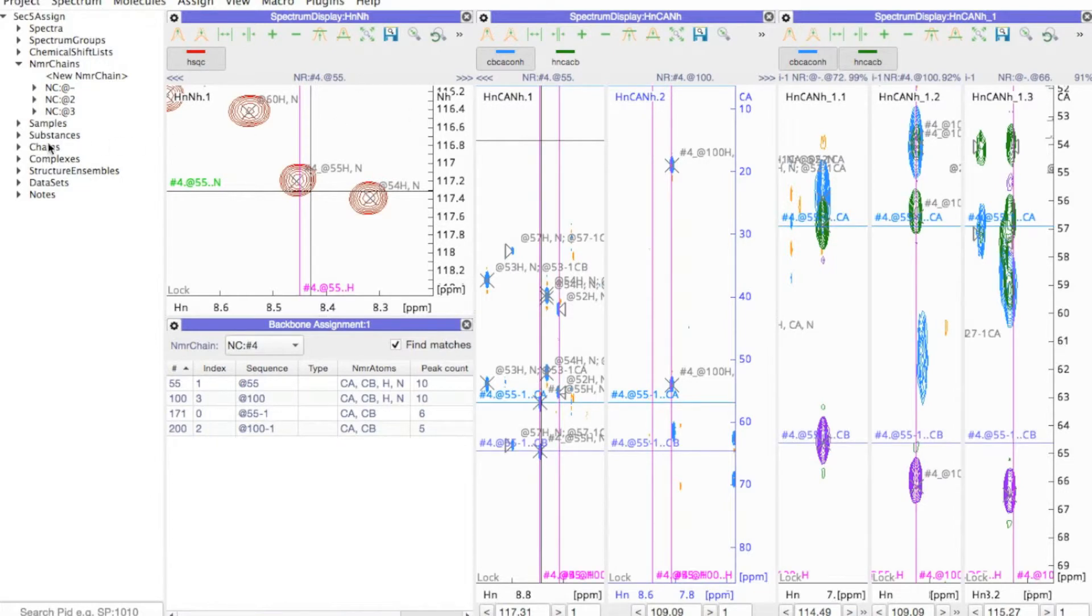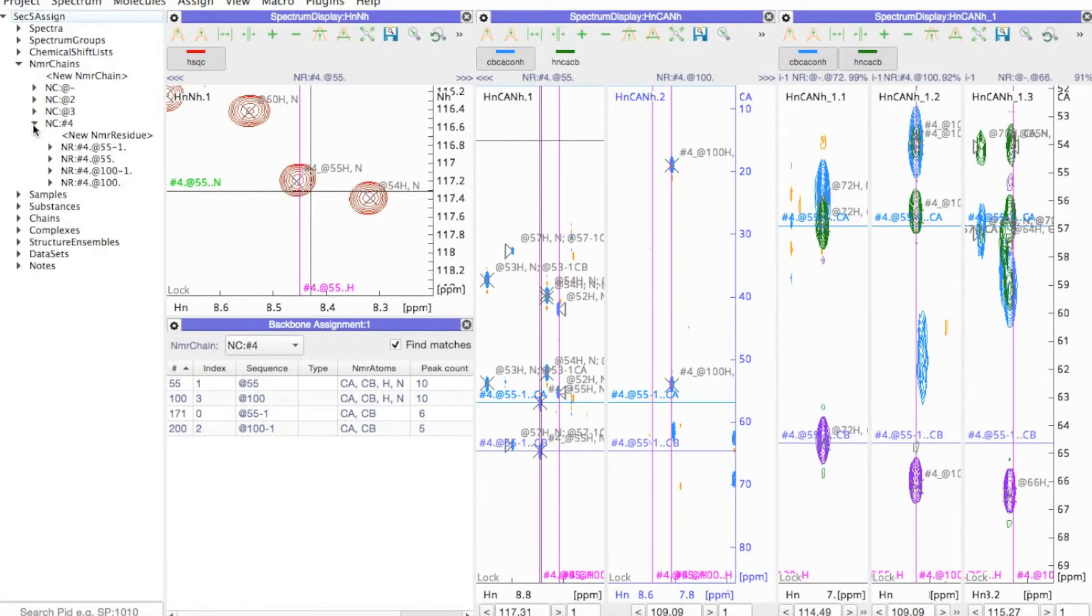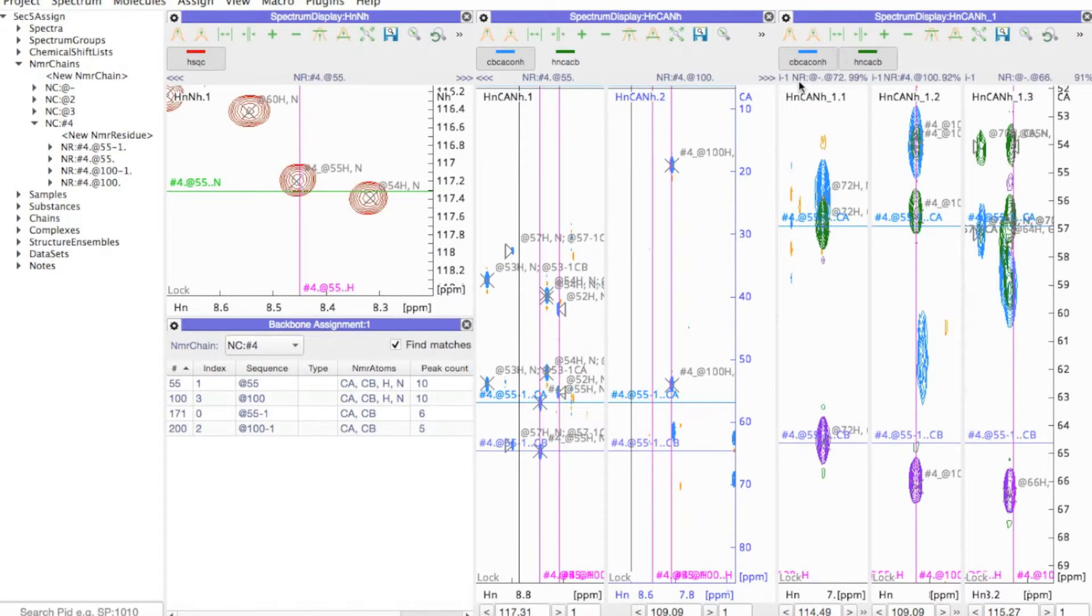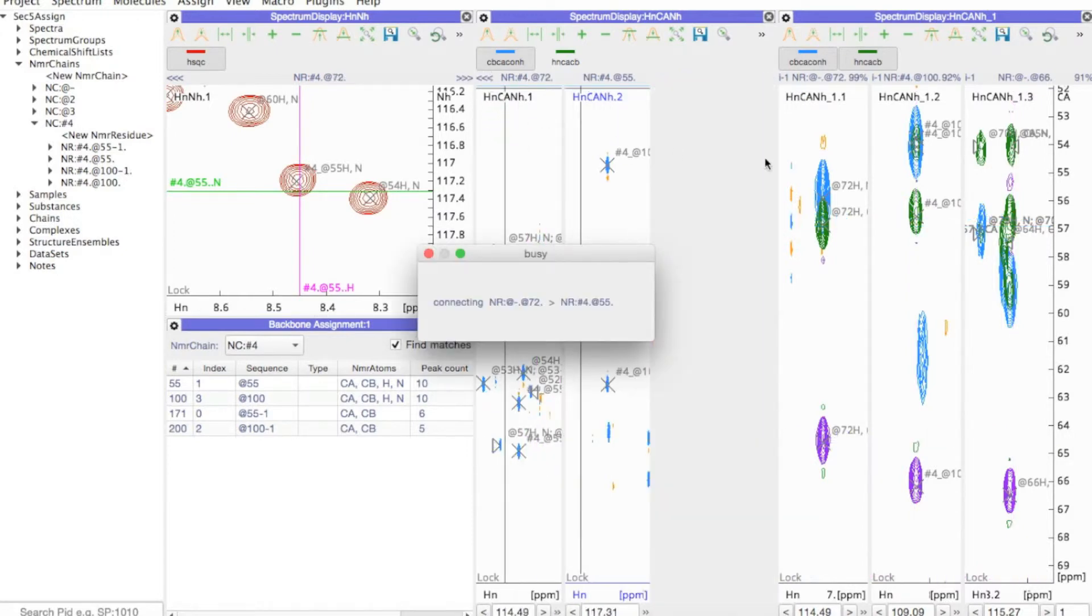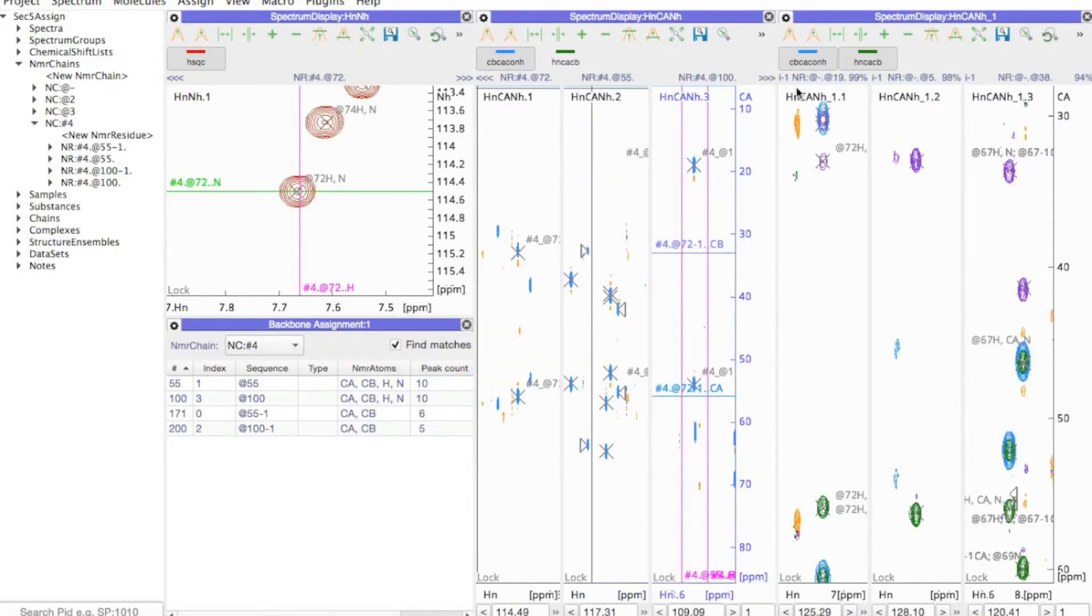And then at the same time, a new NMR chain is created and I can gradually just build up these links and build up a chain of linked residues.